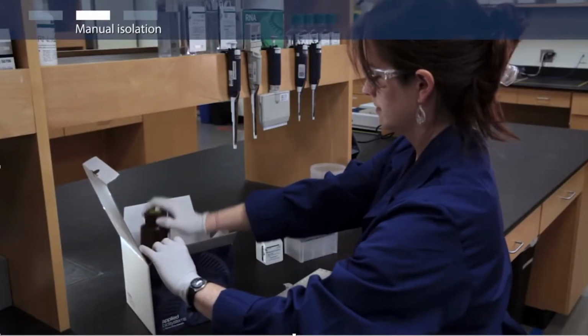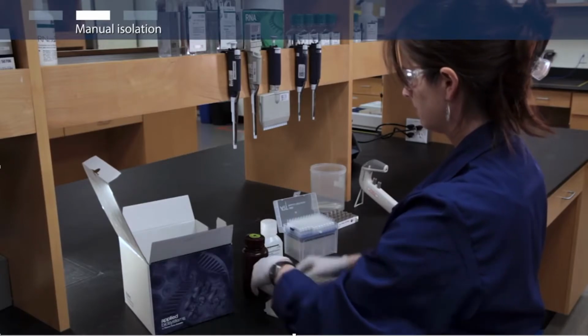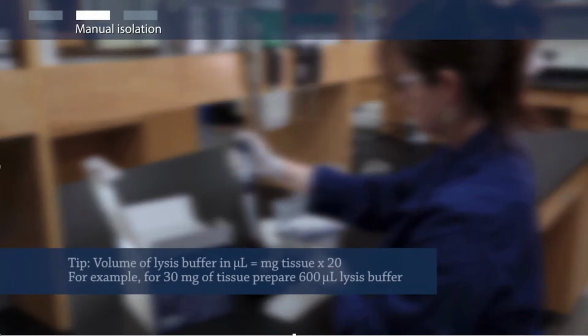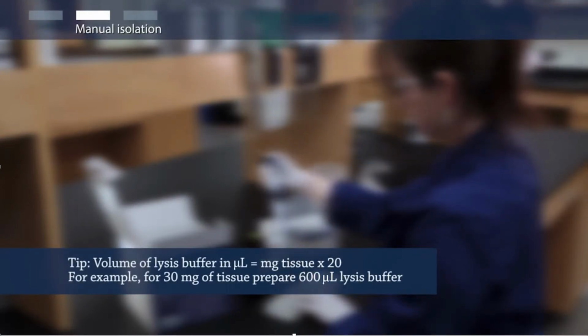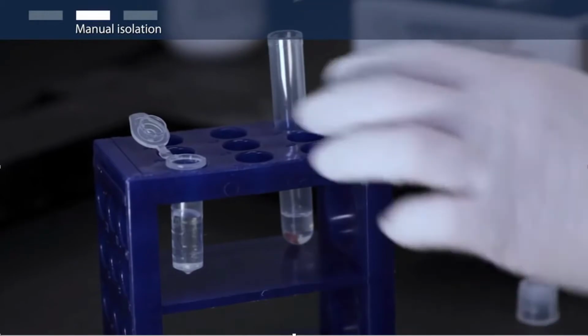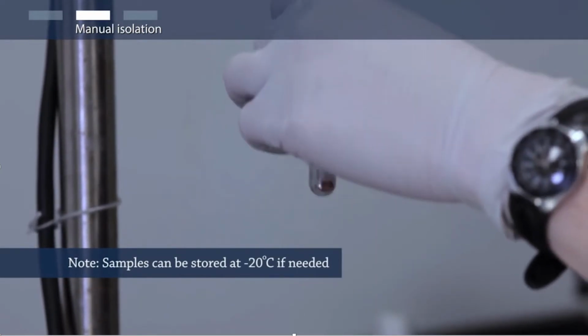Next, prepare the lysis buffer mix. Combine the lysis buffer with 0.7% beta-mercaptoethanol in a 5 ml culture tube. Lightly blot your tissue pieces to remove excess RNAlater. Add your tissue sample to the lysis buffer mix and homogenize for 30 seconds. Then place your sample on ice and let the foam subside.